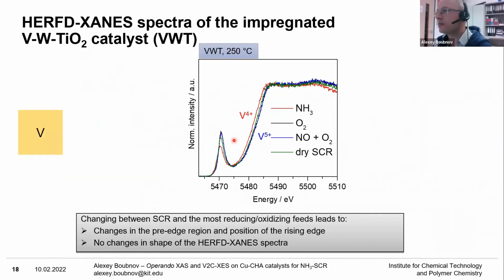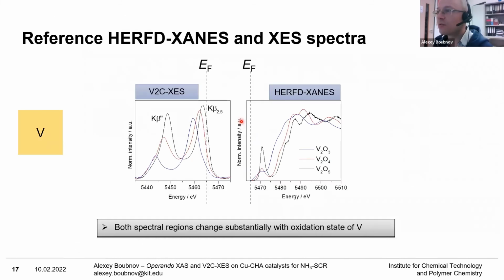So for example, in this case, it was identified as vanadium 5 and vanadium 4. Vanadium 3 has also been shown. So this is a fingerprinting technique, the XANES, and you have to compare with the reference compounds that you have. And the catalyst is not a bulk oxide. So there has to always be a lot of caution. And regarding the comment that you made on using other techniques, yes, of course, the sample has to have seen other techniques before it goes to the synchrotron, because the synchrotron is able to answer some questions that other techniques cannot. But you need to know more about your catalyst in order to really model it or formulate what question you want to answer.